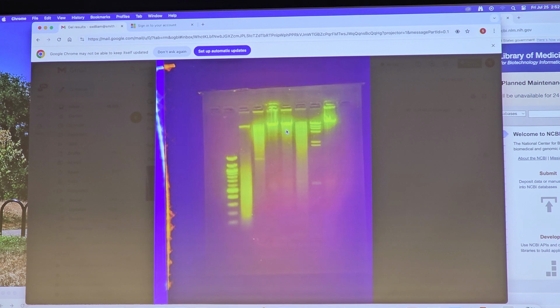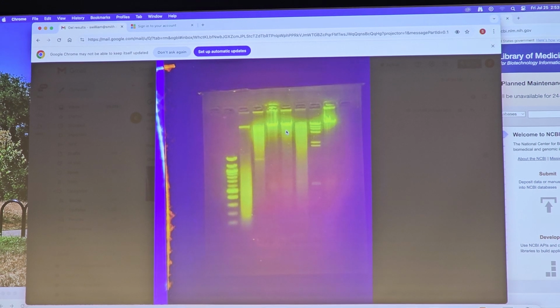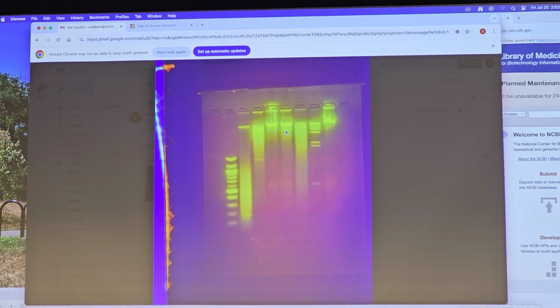So this tells us then that a lot of the genome in adult tissue, adult liver tissue in this case, is methylated. And we know that from other experiments now. This was actually the first way that people looked at mammalian genomes and said, wow, there must be a lot of methylation. Now we have methods, we're talking about PacBio, right, where you can actually look at the methylation state of the genome in a sequencing reaction.